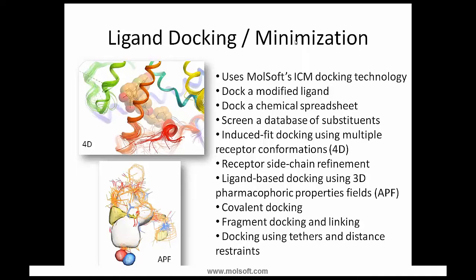You can dock a modified ligand. If you have an SDF file, you can dock a chemical spreadsheet to the pocket in the ligand editor. And you can screen a database of substituents, which I'll show. Induce fit docking using multiple receptor conformations is another example. You can also refine the side chains after docking or during docking. And there's covalent docking and APF docking, which is a 3D pharmacophore method of docking.